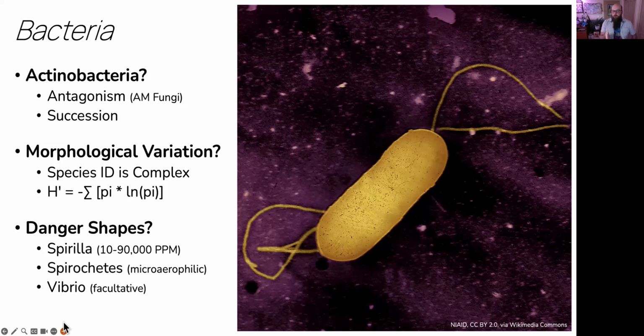So I'm going to go through a couple of categories here of things that we would be able to see through a microscope, starting with bacteria. And I found this very zoomed up picture of, I believe, Listeria. And I don't think that through a 400x total magnification, I would trust myself to not just identify that as a rod-shaped bacteria and maybe say it's totally fine. It looks great. And so there's things about the complexity of the morphology itself that we see.